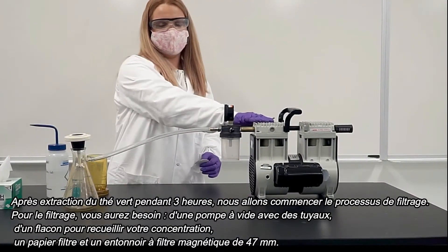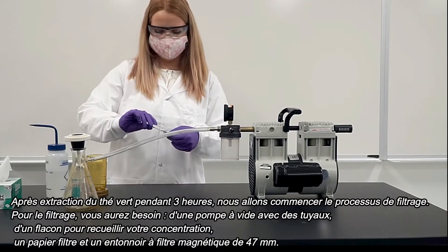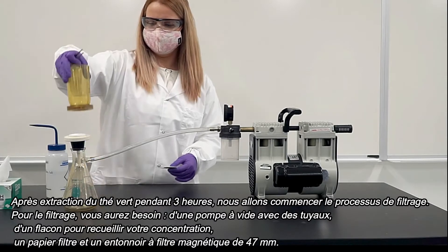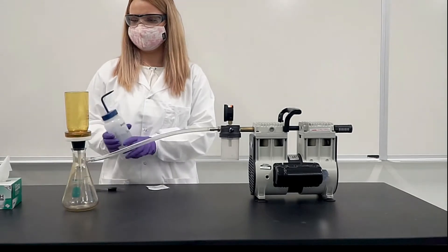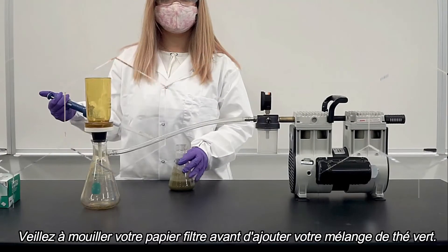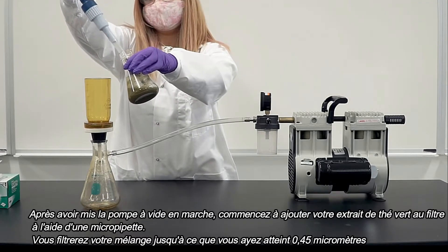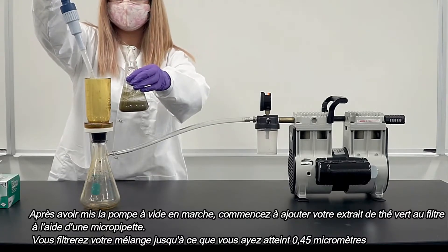For filtering you will need a vacuum pump with tubing, a flask for collecting your concentration, filter paper, and a 47 millimeter magnetic filter funnel. Make sure you wet your filter paper before you begin adding your green tea mixture. After you have turned your vacuum pump on, begin adding your green tea extract to the filter by using a micro pipette. You will filter your mixture until you have reached 0.45 micrometers.